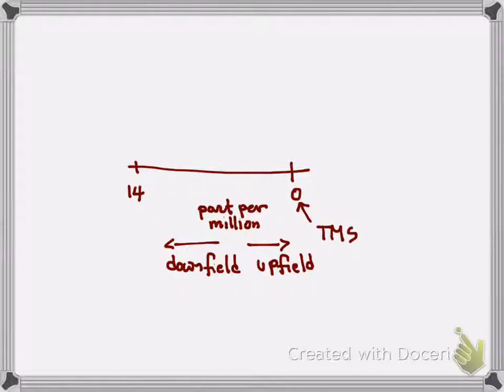Intensity goes in this direction. Technically, the intensity is a magnitude, so it should always be positive, but it's actually a calculated magnitude. Because we're dealing with imaginary numbers in the calculations, which you guys never have to deal with, sometimes you end up with a negative magnitude because it has an imaginary component. When you square it and add it, you can add a negative number. Anyway, it can be below 0, but technically it should always be above 0. That's just the difference between experiment and theory.